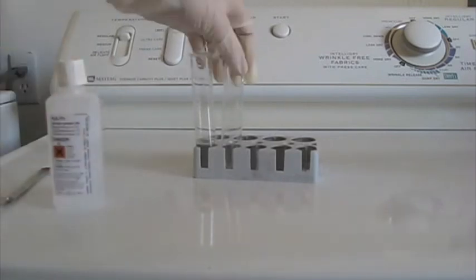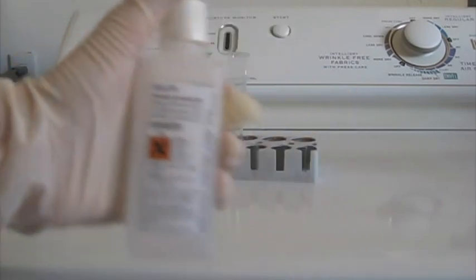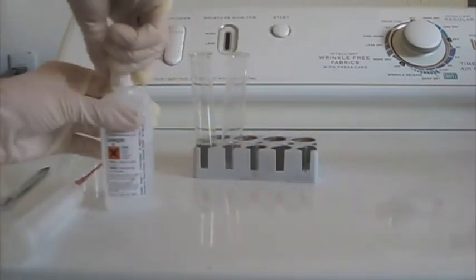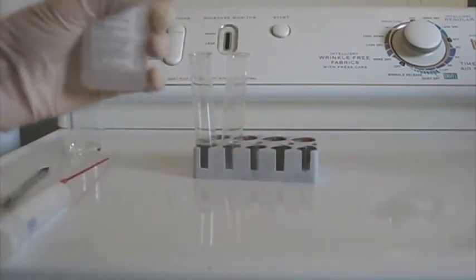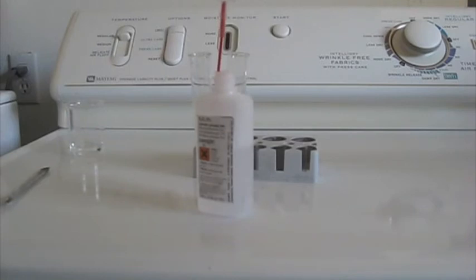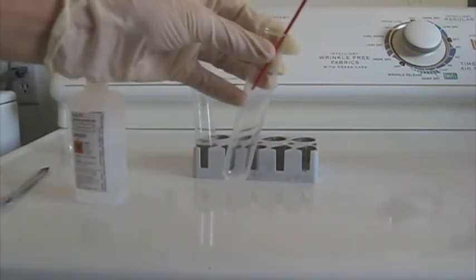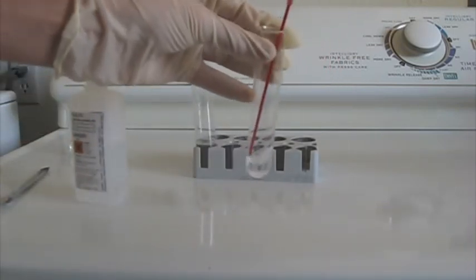Now in the second test tube, I'm going to place about 5 milliliters of hydrogen peroxide. Here's 5 milliliters of hydrogen peroxide.